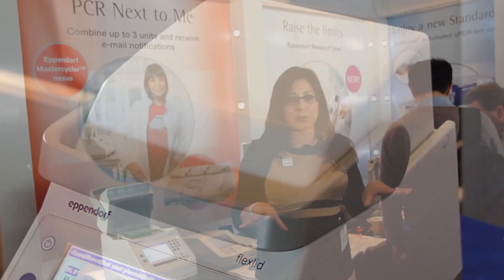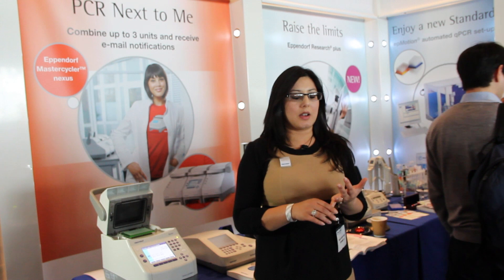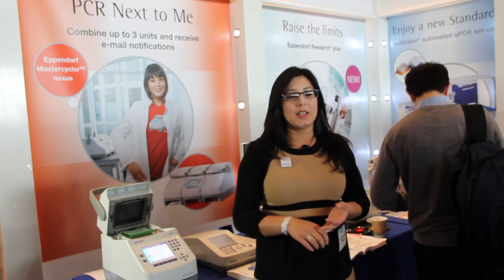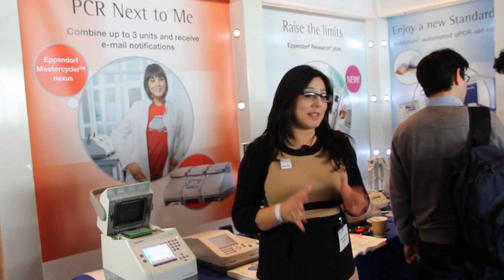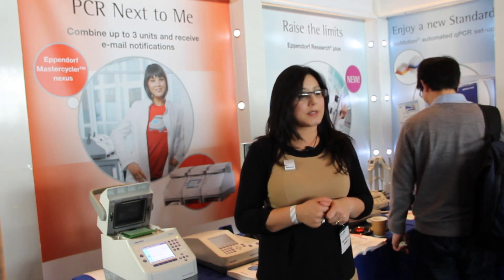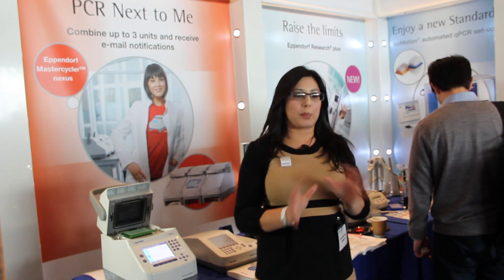You can use any type of consumable in our machine, so that's always good. You can use 0.2 tubes or plates, and then you can use strips of 0.5s as well. The block is very unique to us because you can put 0.2s and 0.5s in the same block instead of having to change blocks — so that's 0.2s, 0.5s, or plates.